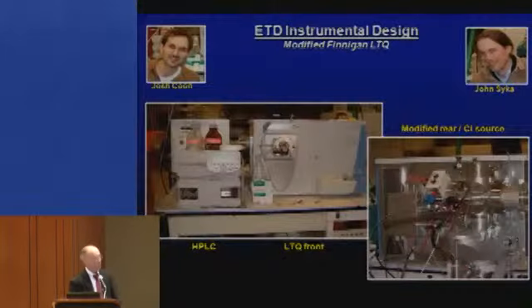So let me take you through a brief review of electron transfer dissociation, that was discovered in our lab about 2004. And it was a response to Fred McLafferty and their discovery of being able to fragment proteins with electrons. And we wanted to be able to do it inside a linear ion trap mass spectrometer, and you can't do that with electrons because they can't be stored. So we adapted this linear ion trap for electron transfer dissociation, where we do the chemistry with something that traps ions.